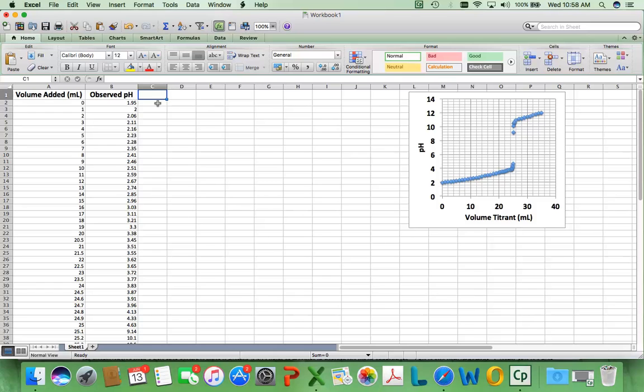So we're going to have to generate another X and Y data series. We'll call them X and Y for right now. This is going to be for the first derivative plot. Now, when we think about plotting the first derivative, we have to come up with a pretty good mental picture of what it is we're plotting.